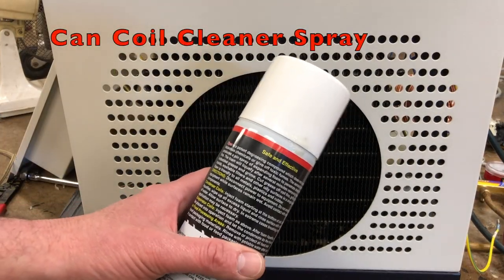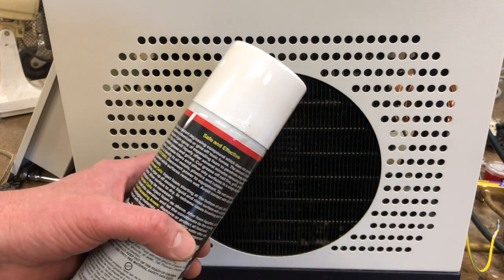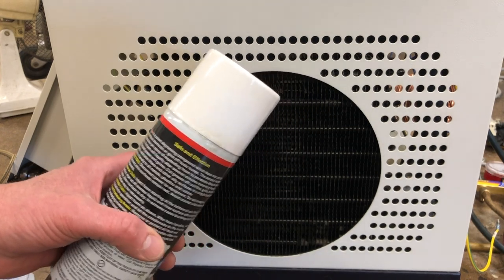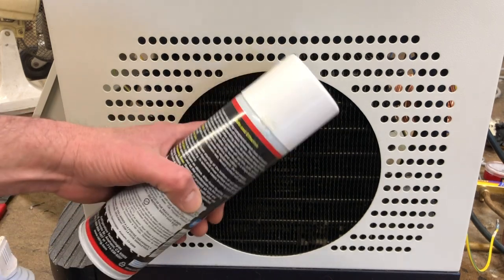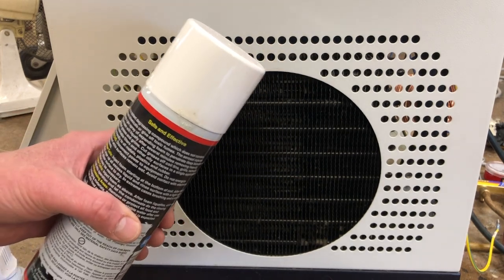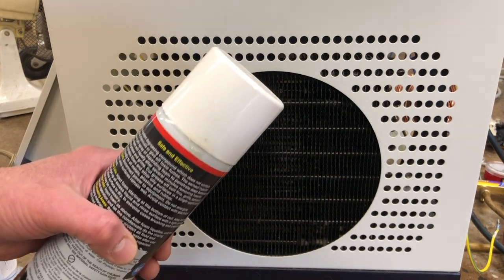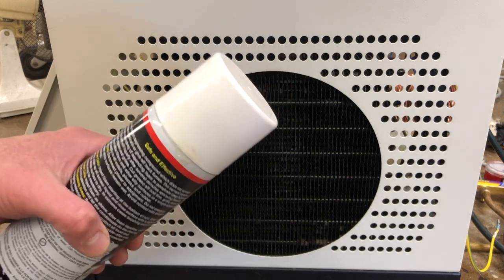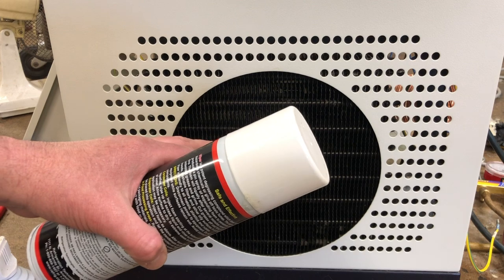Here's a can I got from my refrigeration supply — it will do the trick but I really don't recommend it for somebody who's not refrigeration trained. In addition to the fact that you might do some damage to the fan behind here, it also smells pretty bad. The one thing you don't want to do is use water, because that will definitely gunk things up and could get into the electronics behind here and really make a mess of things.